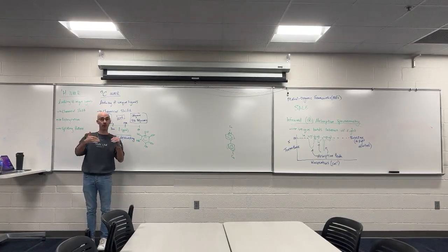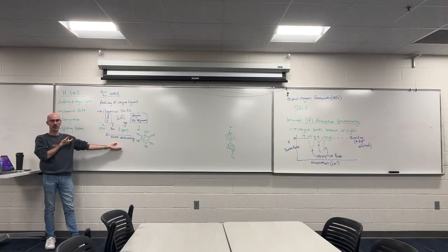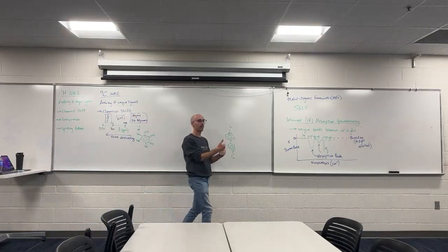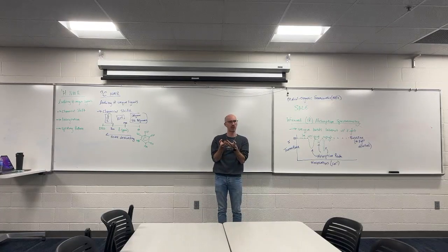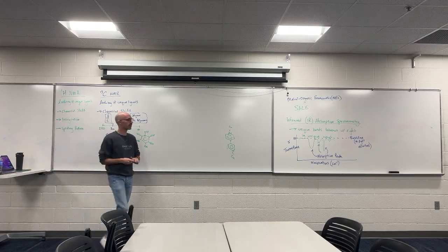Remember parts per million, which was the chemical shift of NMR. That is frequency, parts per million. Wave numbers, some number per centimeter. That's how many waves you see per centimeter. That's a frequency. Typically, the frequency of light is reported with units of inverse seconds, per seconds, also called hertz. But here we're looking at wave numbers.